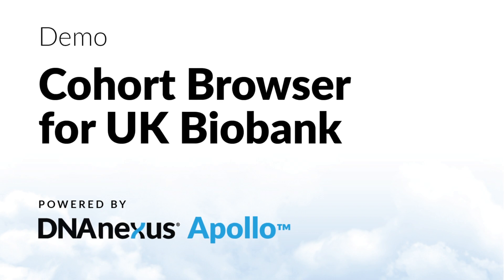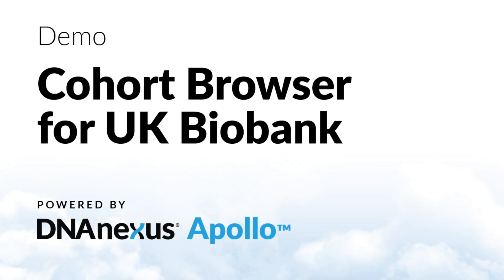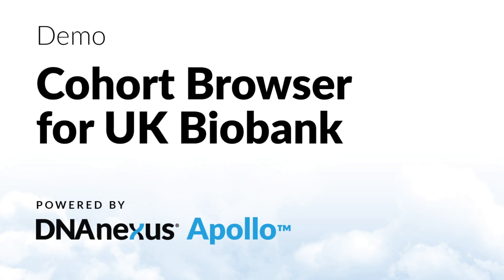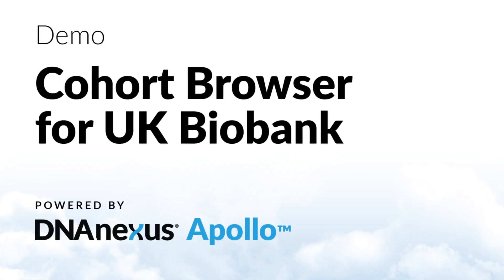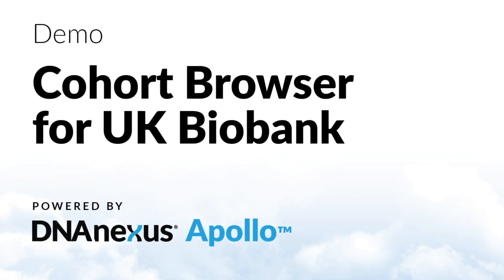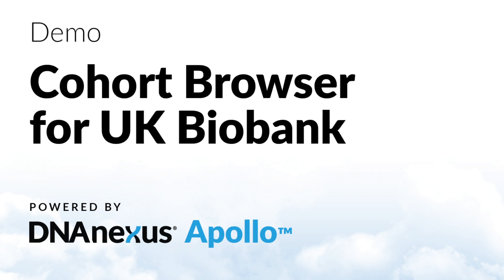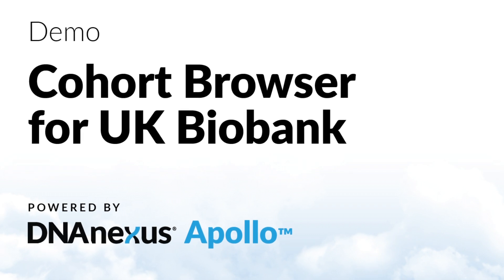Today we'll be exploring the DNAnexus Cohort Browser, an innovative application of the Apollo platform allowing for easy at-scale navigation and exploration on complex heterogeneous data sets.